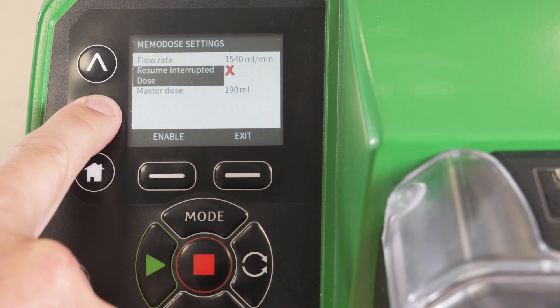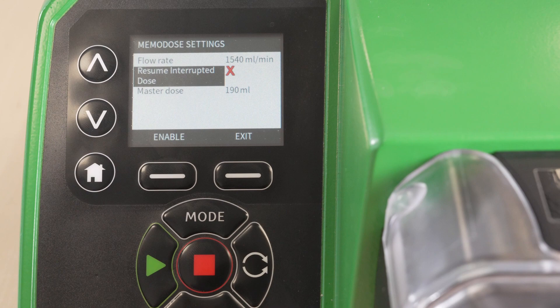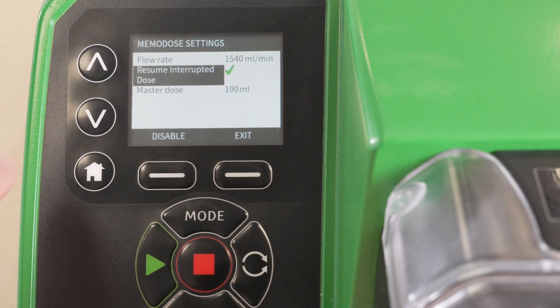You have the option to resume or reset a dose after dosing is interrupted. In this demonstration we will choose Resume.